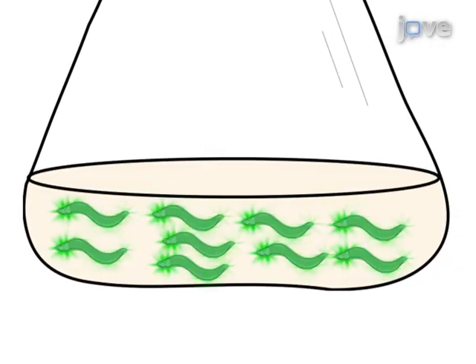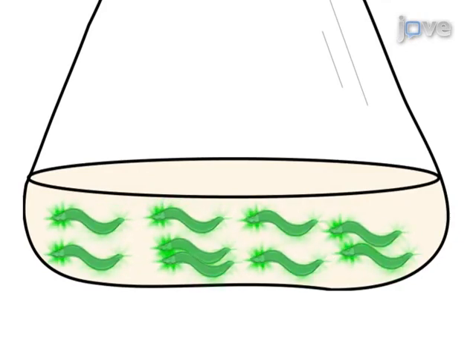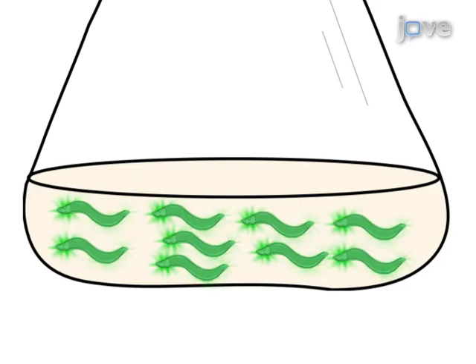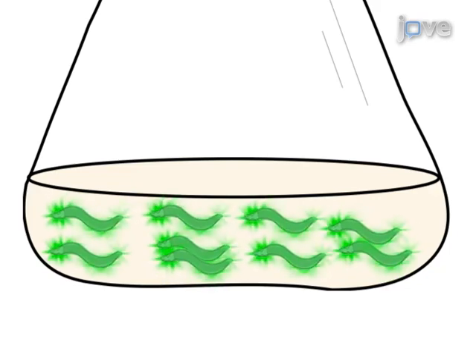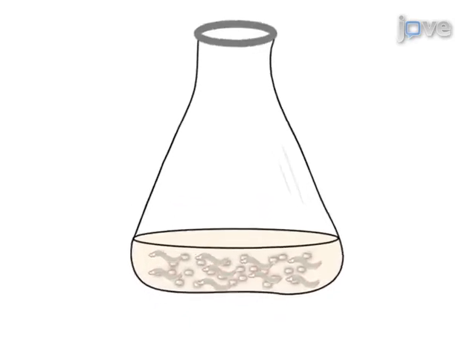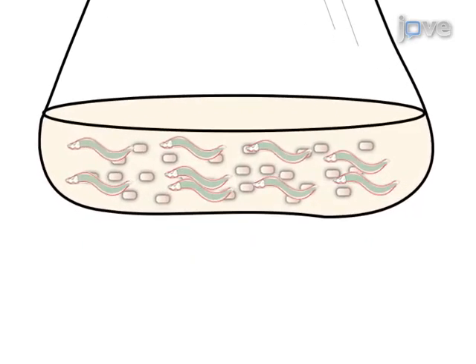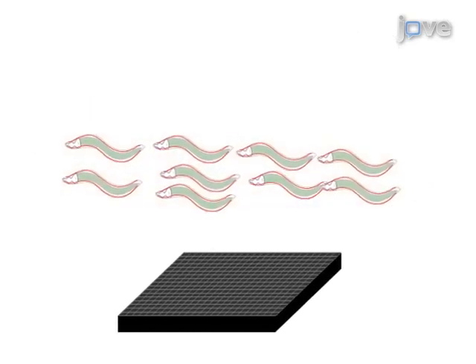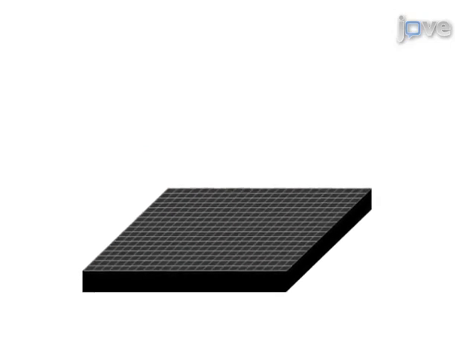This video demonstrates a method to culture and dispense fluorescent strains of C. elegans for high-throughput screening of chemical libraries or detection of environmental contaminants. To assess the effect of chemical or environmental agents on specific protein activity in C. elegans, bacterial cultures are first prepared as food for the worms and GFP transgenic synchronized worms are cultured. 0.5 to 2 million worms are then collected, washed and dispensed into 384-well microtiter plates.